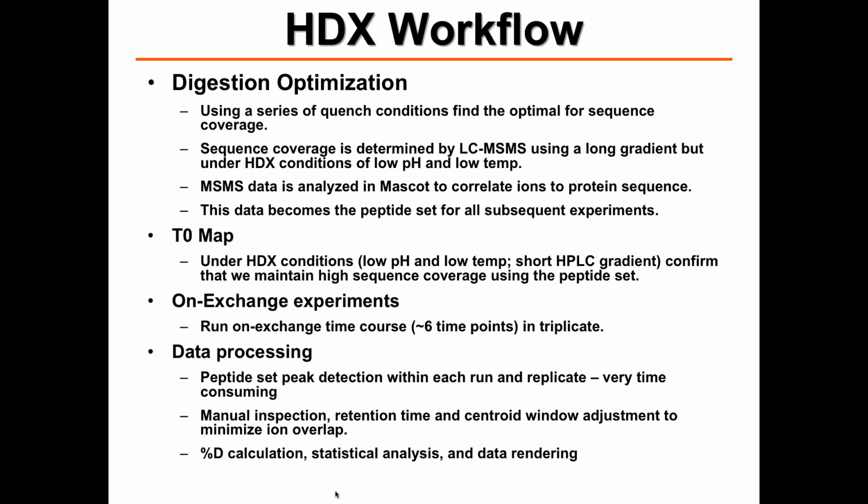What happens with those peptides is, one, they might be big and have a lot of charges, so they're high charge state and they fragment poorly. Then when you do the database correlation, you get a very poor score, so they're eliminated. Now, our software will go back, because we have such high mass accuracy, we can rely on the MS1 data alone, the mass measurement, but that comes with a risk, right? We could manually inspect and see whether that MS vector is indicative of that sequence. But what we found is that if we use the MS/MS too, we eliminate a lot of the potential artifacts that you may have.